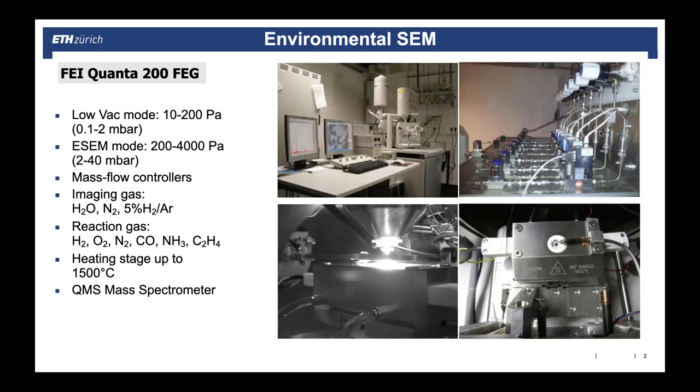It's an environmental SEM. And in Berlin, we have equipped that instrument with a number of gas flow meters, so we could precisely dose different types of gases directly into the chamber. And then we had a heating stage, the commercial heating stages. They're fine, but if you do reactions in reactive atmospheres, these conventional heating stages usually suffer because the heating stage has a hot wire. And when you do experiments in crazy gases, then these heating stages actually also die with time.